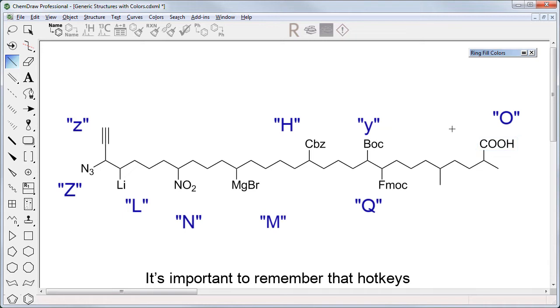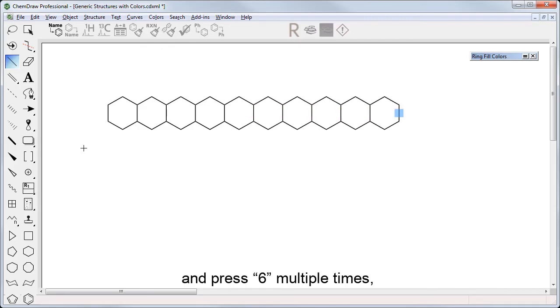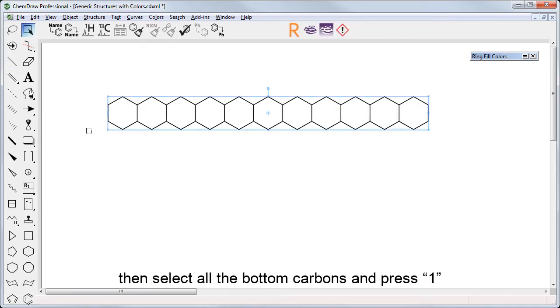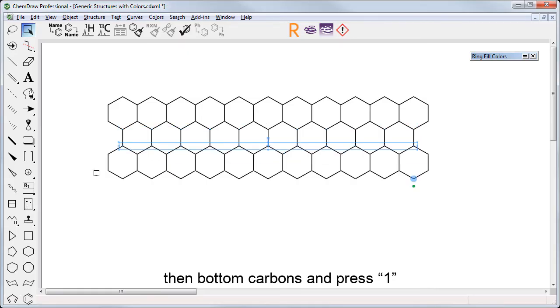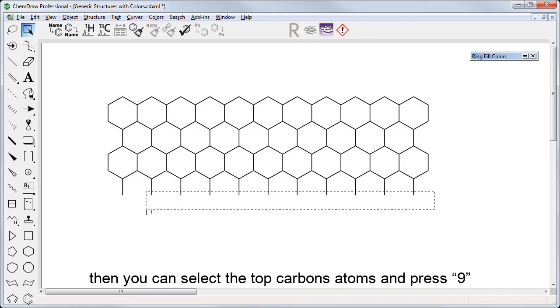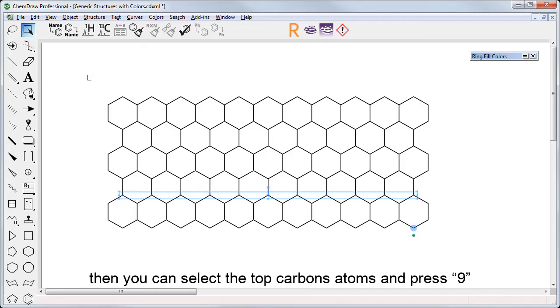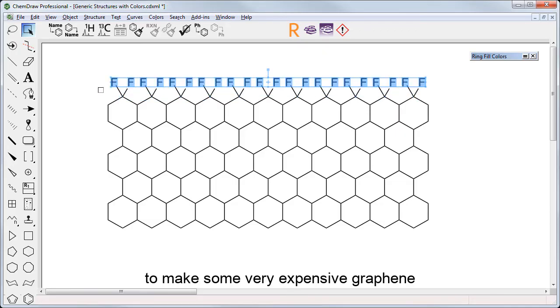It's important to remember that hotkeys can apply to an entire selection. Here I have positioned myself over a bond and pressed 6 multiple times, then select all the bottom carbons and press 1, then bottom carbons and press 6, bottom carbons press 1, bottom carbons press 6, then you can select the top carbons and press 9, and why not select the top carbons and press F to make some very expensive graphene.